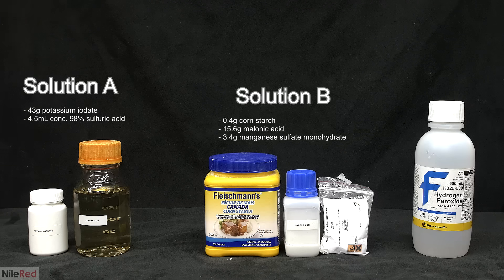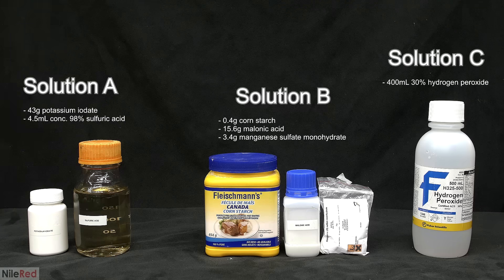For solution B I used cornstarch, malonic acid and manganese sulfate. Some guides for this reaction claim that the malonic acid can be replaced by acetone but I tried this and it didn't seem to work. For solution C all I need is some 30% hydrogen peroxide.